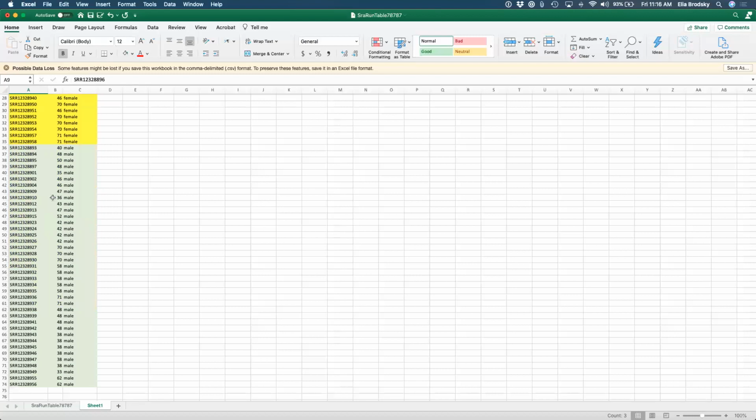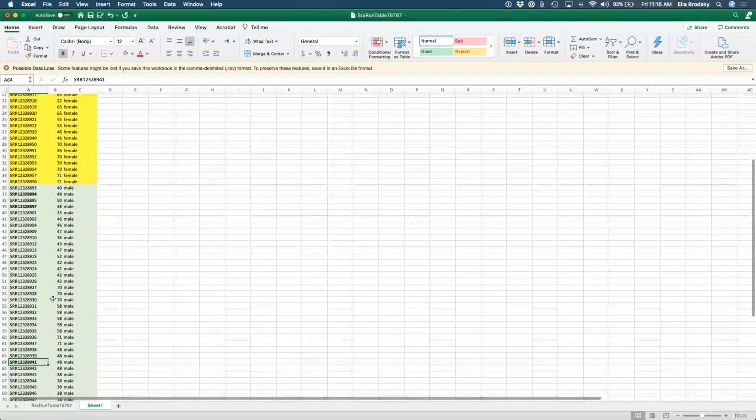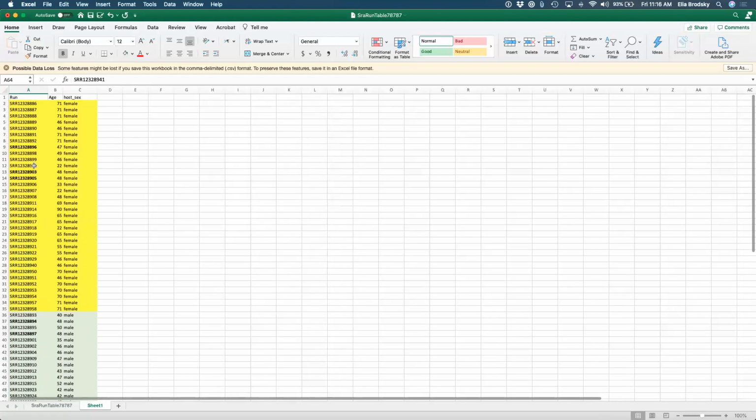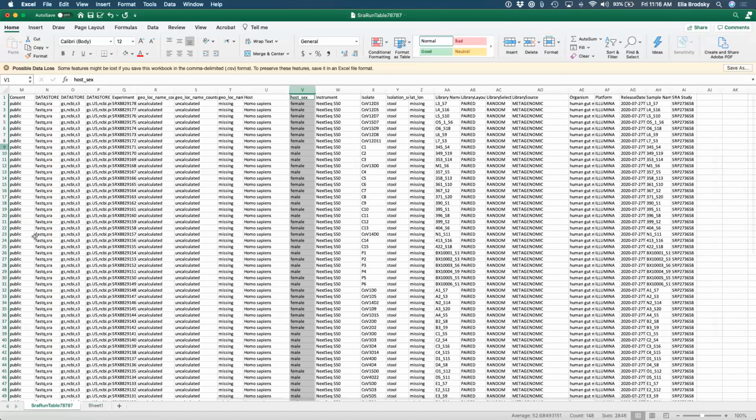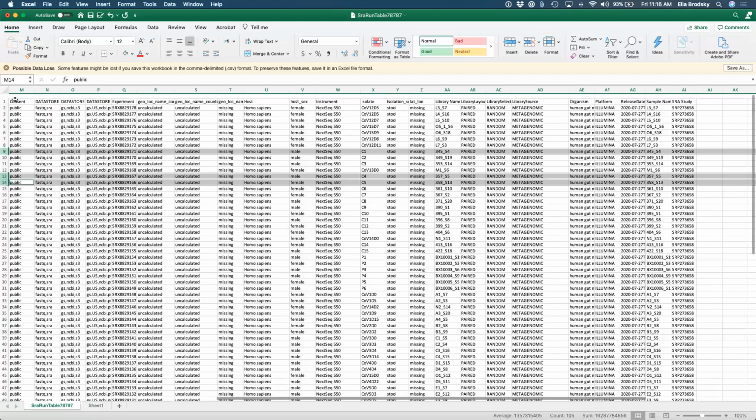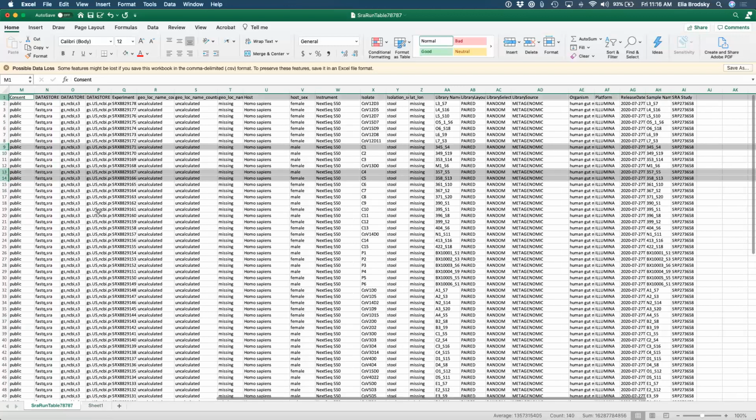So we don't have exactly many for 48, but here's one, 48. Here's another one, 48, and there's another few 48. So right there. Okay, so if we want to take these samples, we can take them from here. Okay, so we have 9, 13, 14, and we'll take the first one.